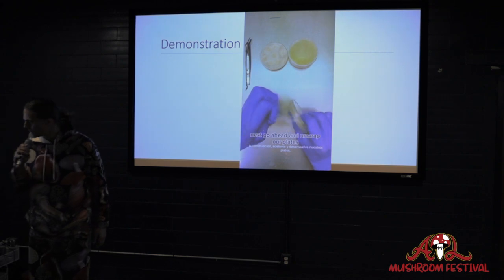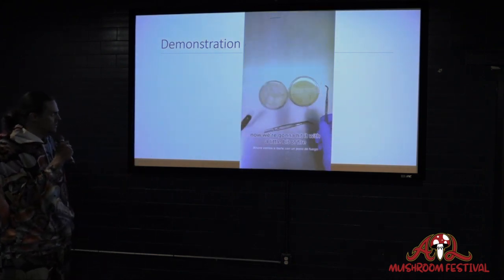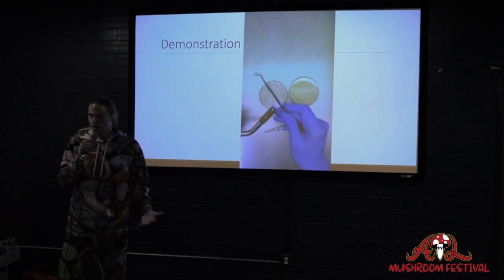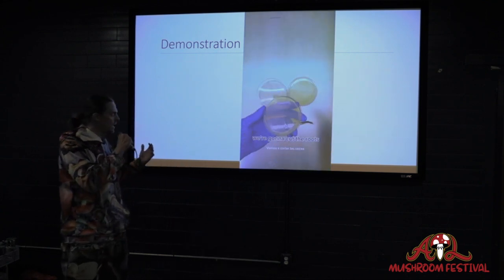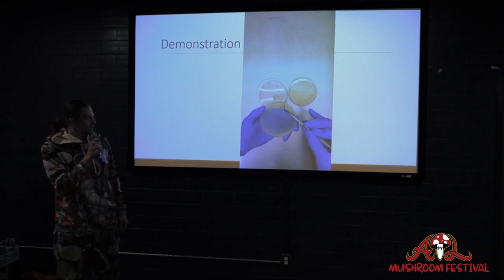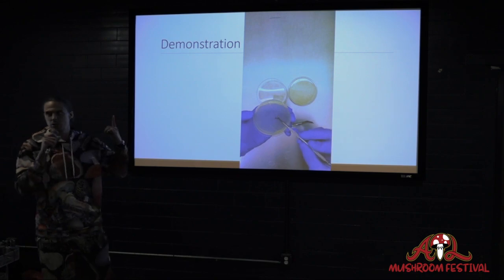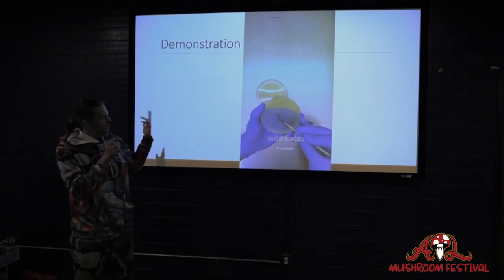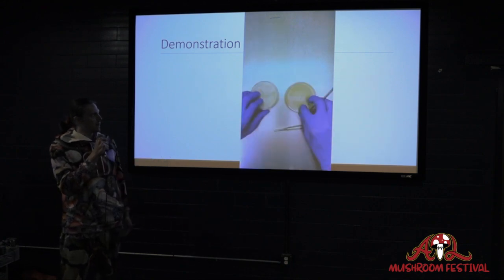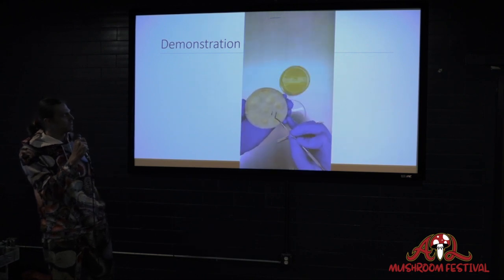So here I'm just cleaning everything because that's really important. And then I'm preparing all of my plates. And now I'm sterilizing the tool in order to make sure that it's not contaminated. So you heat it up really hot, and it should definitely sizzle while it's on the plate. And so in making cabin sequestering plates, you need 2 plates. You need 1 plate to be your cover slip plate, and then you have the other plate that's your cabin plate. And for this example, I'm just doing 1.